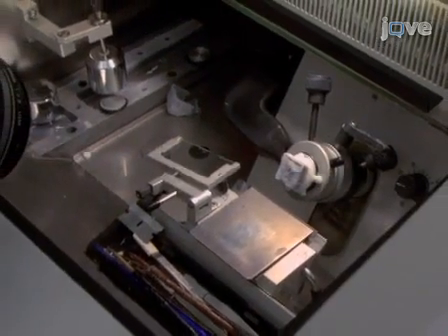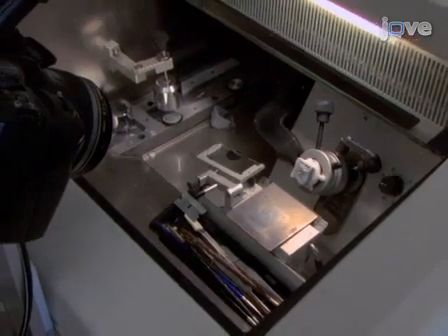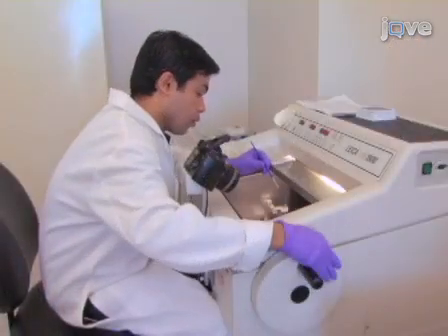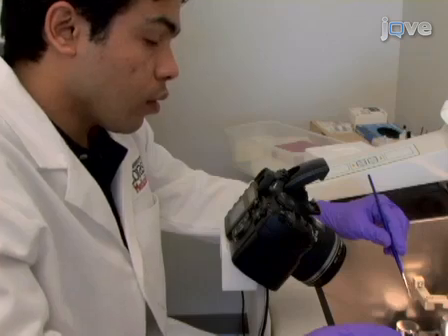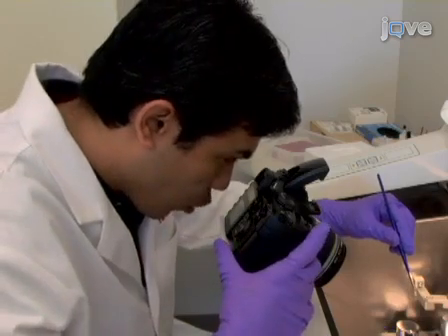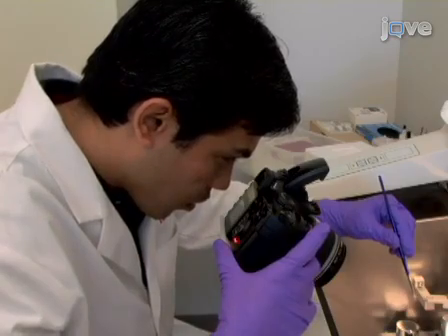Acquire block face images using a digital camera mounted to the front of the cryostat. Images should be taken every 50 micrometers through the entire brain volume. Number the slices to allow registration within the volume after histological processing and staining.